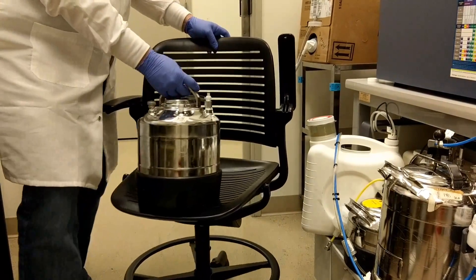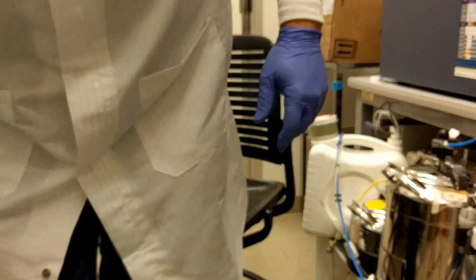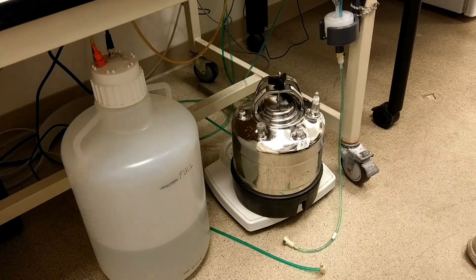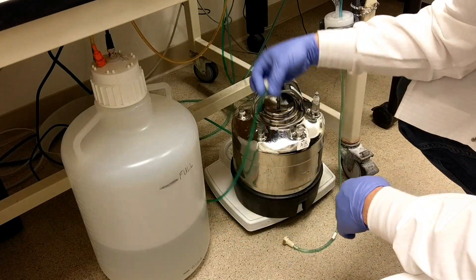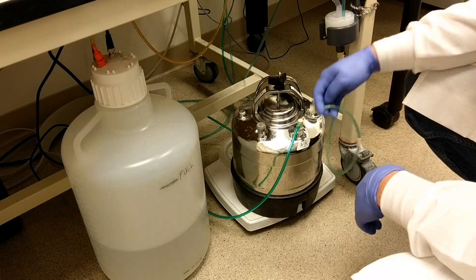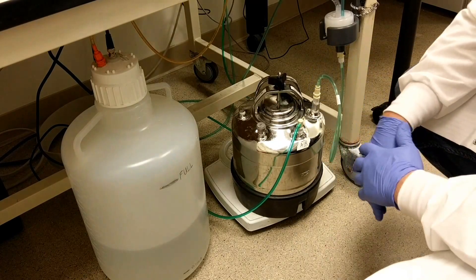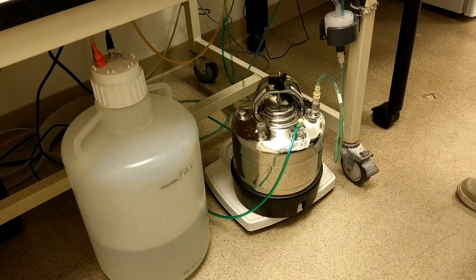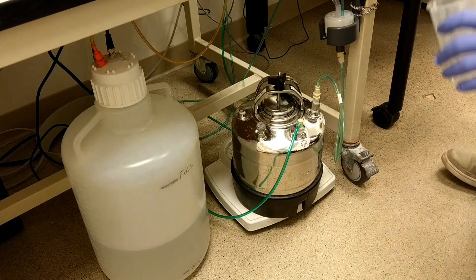Now you can wheel your chair back over, take the tank and put it back. Now you're going to reconnect your airline and your sheath line to the tank.